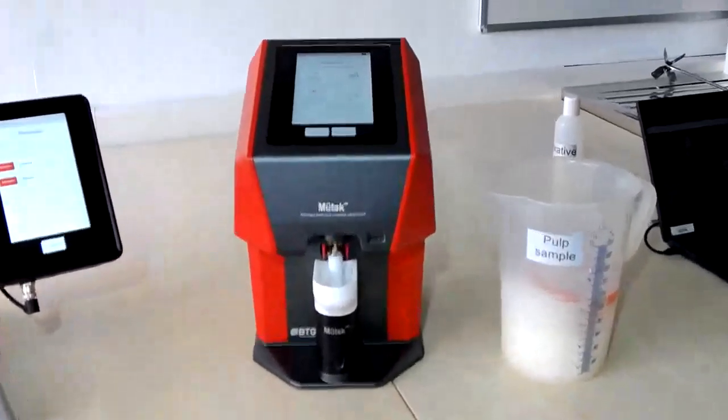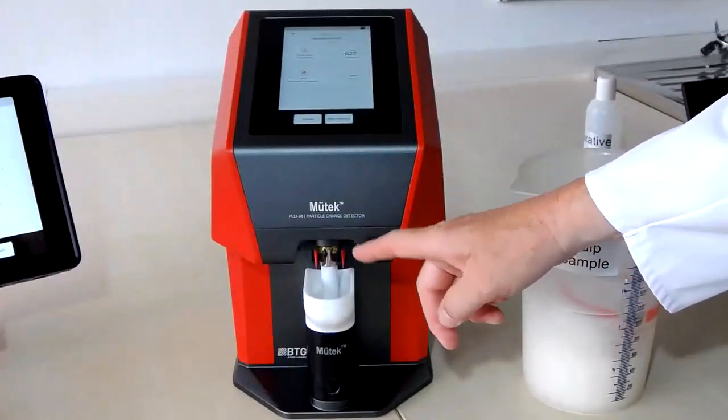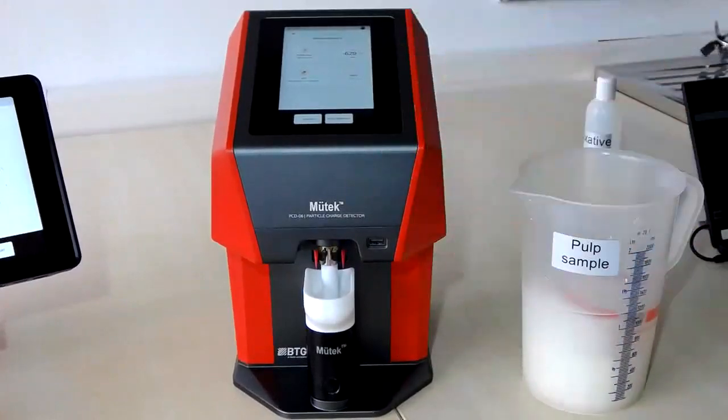So what is happening now in the PCD, as you've heard from Todd, the piston is now stroking up and down, creating a continuous up and down flow of the liquid. And with this flowing liquid, we are shearing off counter ions around the charged particles, creating a streaming potential.